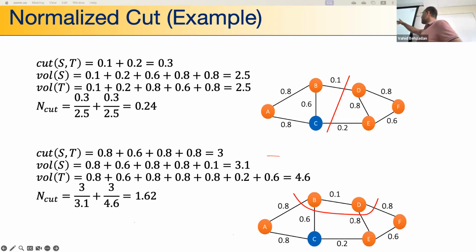So a connection means there is similarity. They are close to each other based on the Euclidean distance or the cosine similarity. Because each cell, let's say, has 100 genes, right? And you have a different value for each gene. So you take the difference between 100 values and 100 values, calculate the square of each difference and take it under the root. What does it mean by 0.1, 0.3?